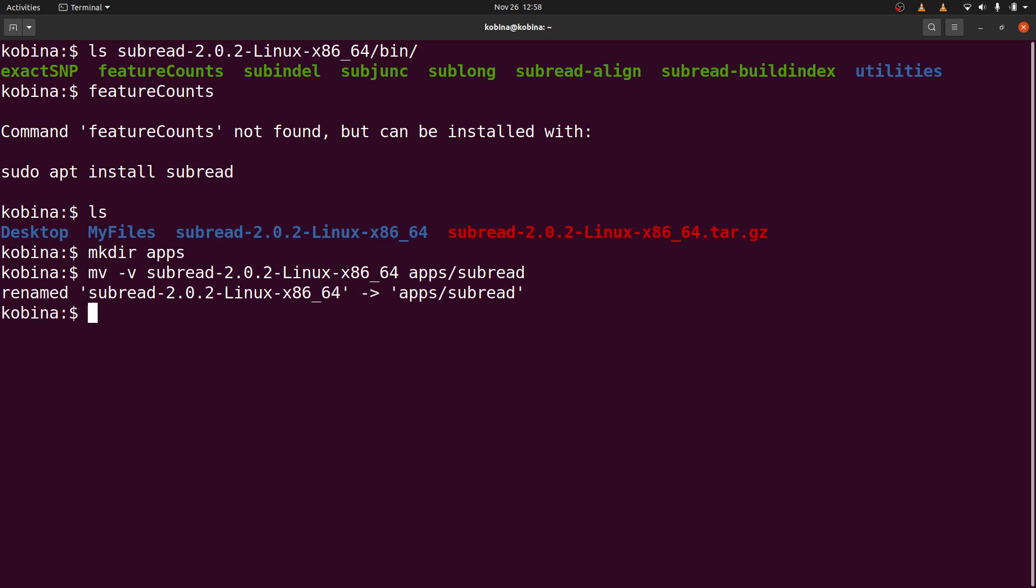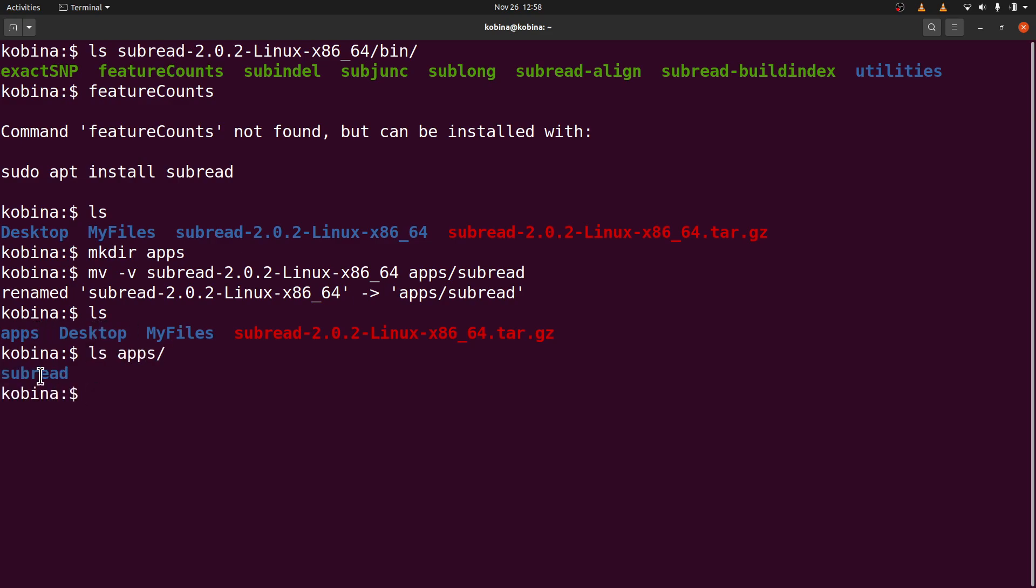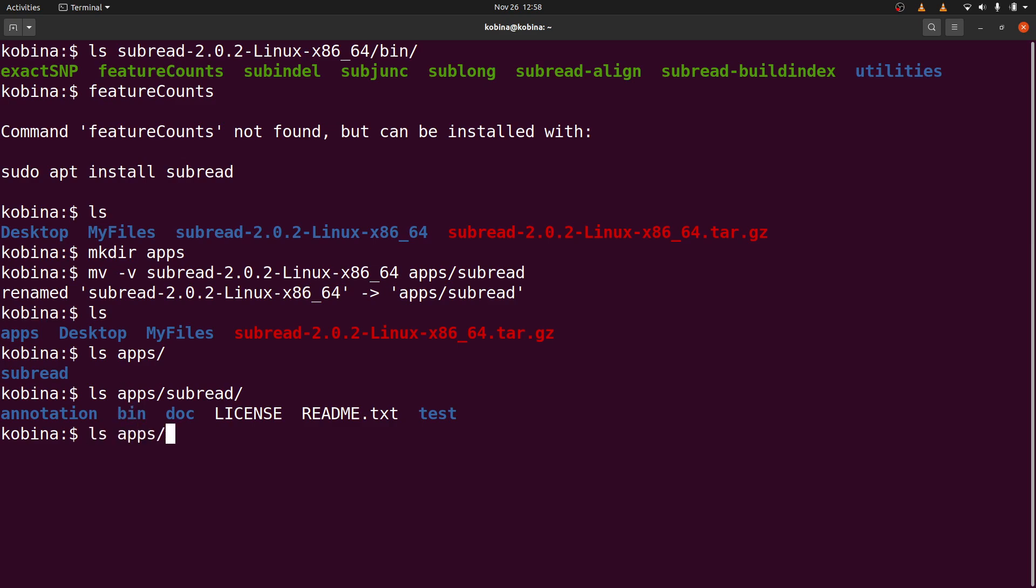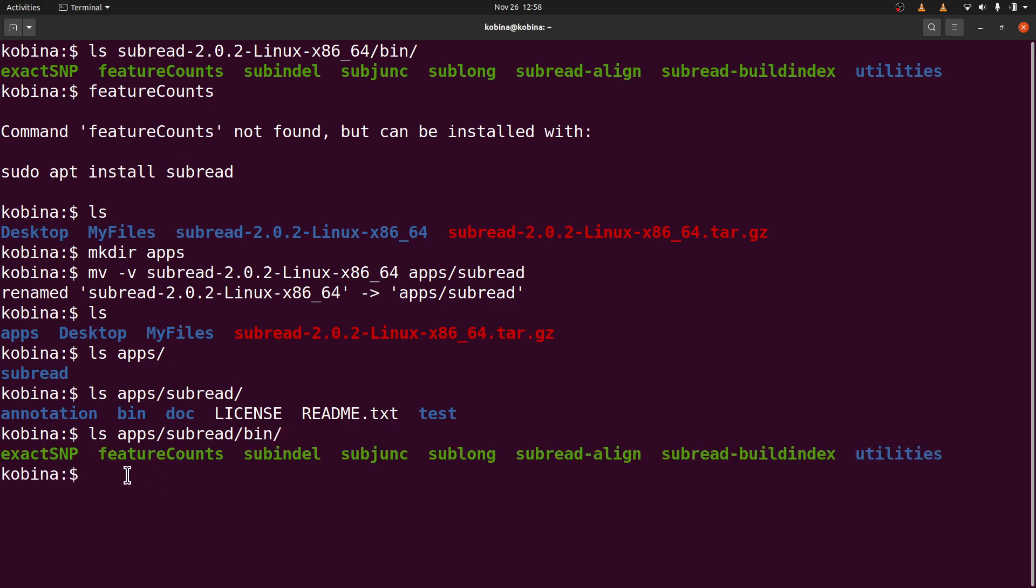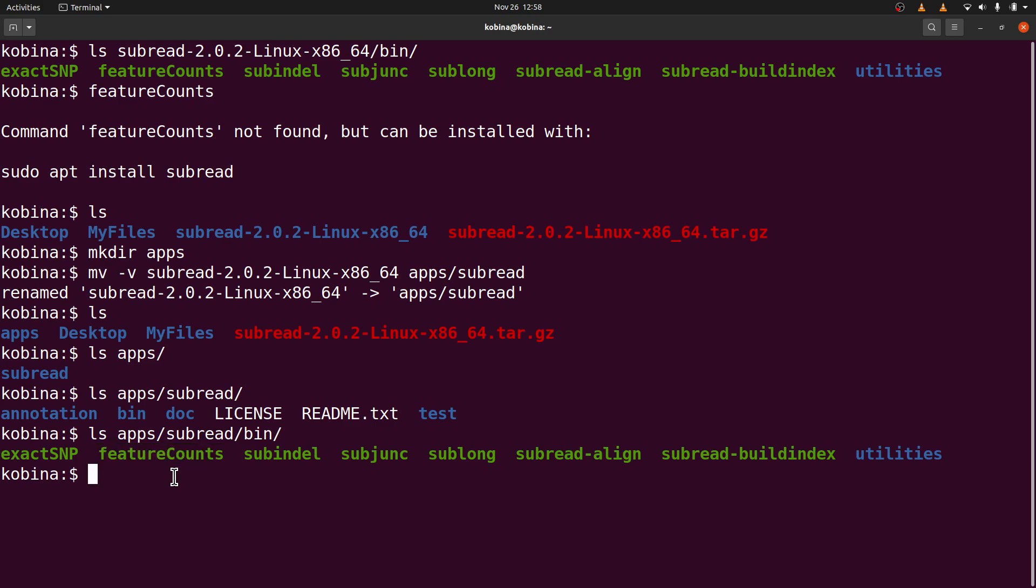After that, I'll move into that directory again and get the absolute path for featureCounts. Let's do an ls again. We have our apps. Let's do an ls into apps. See our subread. So let's ls again, apps subread. And also ls again, subread. And see our featureCounts here. So that's what we are going to do. We are going to get the absolute path for featureCounts. And there are different ways you can use to get the same information. But because some of my viewers are beginners, I will use a very simple approach which everyone can follow.